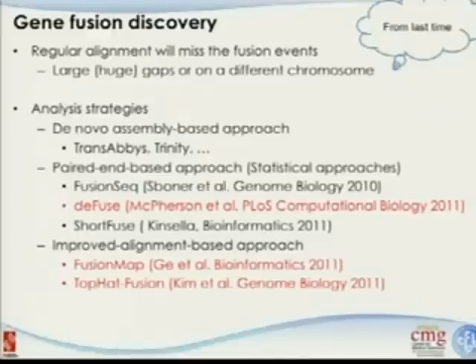which we talked about, Trinity, last time already. And those can be really important. And also, there are some other algorithms that are based on paired-end approaches or improved alignment-based approaches. This is a single-end-based approach. And I'm not going to go into the details of each individual methodology, but as you can see from here, most of the publications were published in this year.